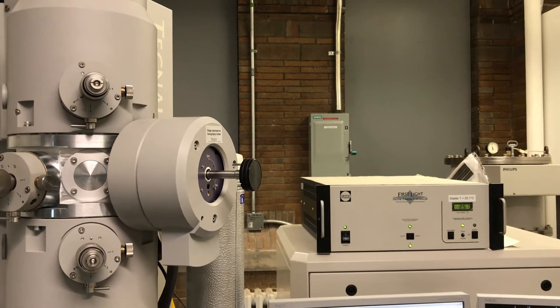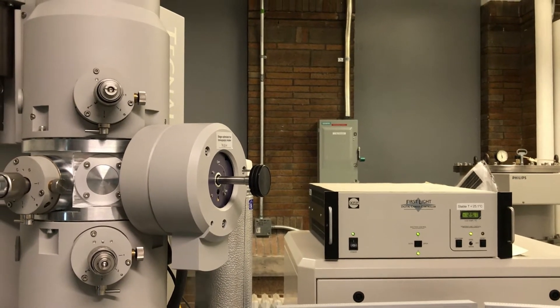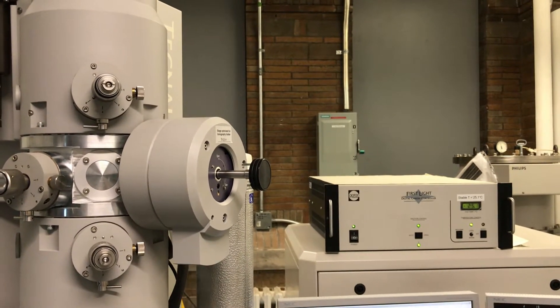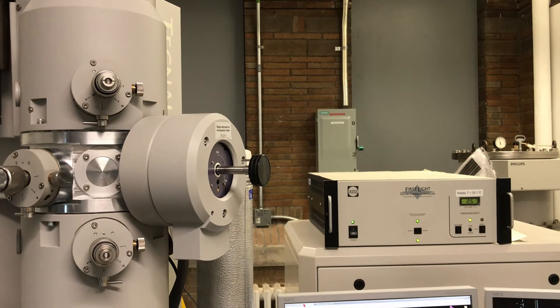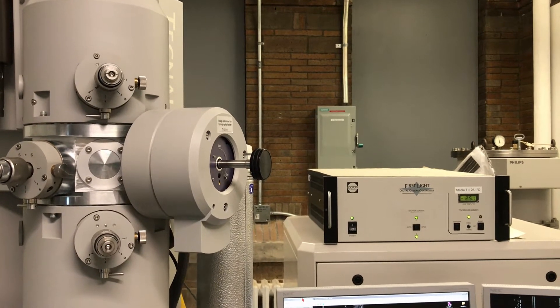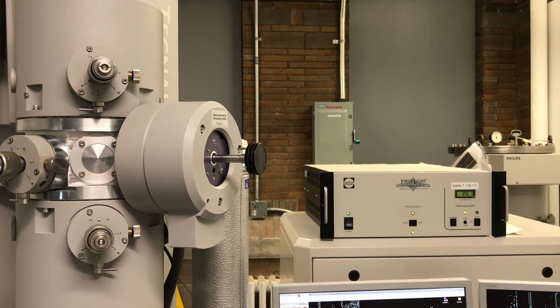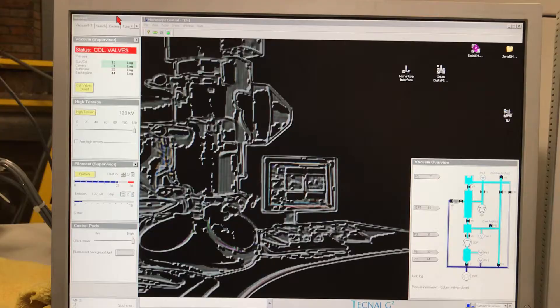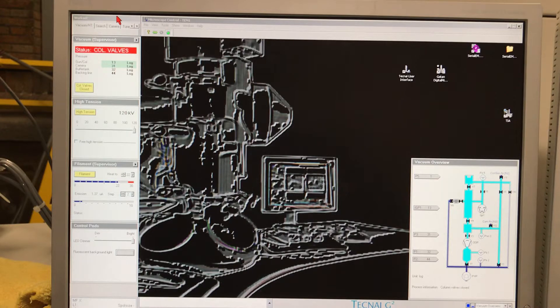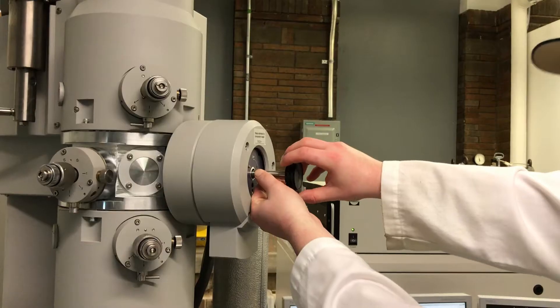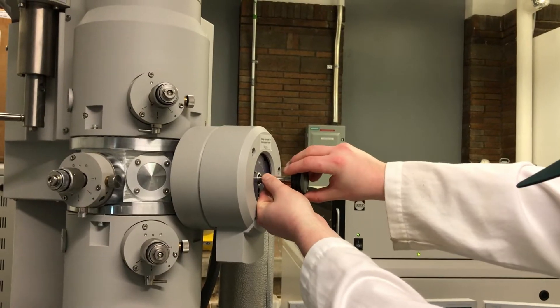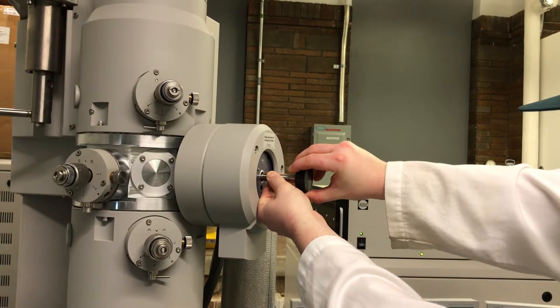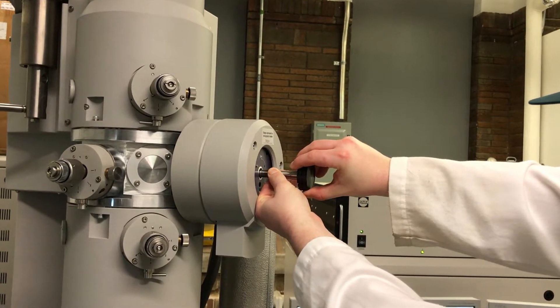Then we go back to the TecNai user interface and check the vacuum values for the gun and column section. The values should still be in the green if you pulled the column in the right manner, and then you're ready to remove the room temperature holder from the compute stage.